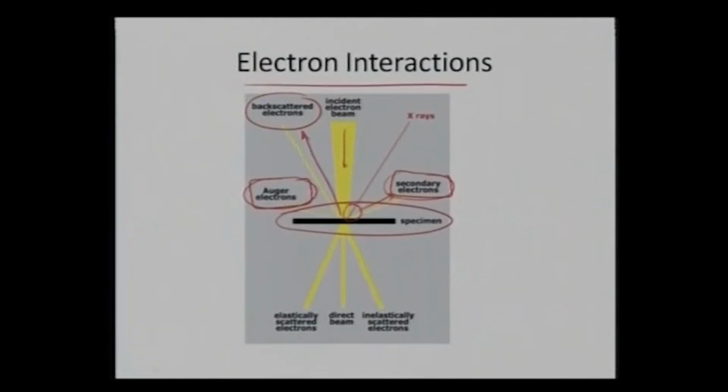They can also interact with the material to produce something called X-rays. So, we can see that all of this is happening where the electrons or those signals can be detected back above the sample regime. They are not allowing the electrons to pass through the material.